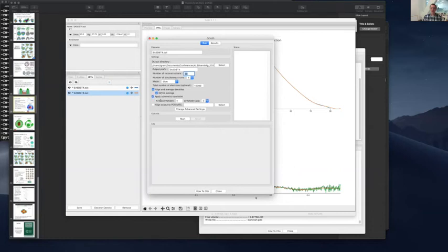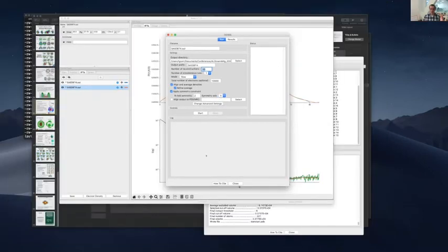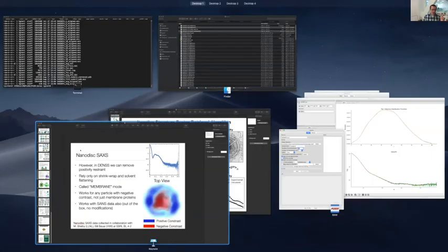If you would like to apply symmetry, you can do that here. But note that this does not have dihedral symmetry. I think the latest version of RAW does, this is an older version of RAW. But if you would like that, either download the latest version of RAW or you can install DENSS directly. As I mentioned, you can actually also choose what symmetry axis you want. So X, Y, or Z just means long, middle, or short principal axes. So if you've got something that's elongated and you know that it is symmetrical about that long axis, for example, this, where's that glick thing that I had?